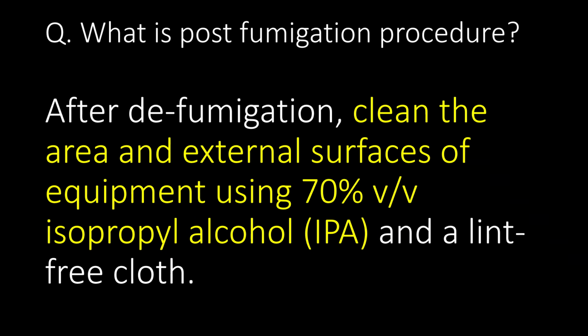What is the post-fumigation procedure? After defumigation, clean the area and external surfaces of equipment using 70% volume by volume isopropyl alcohol, that is IPA, and a lint-free cloth.